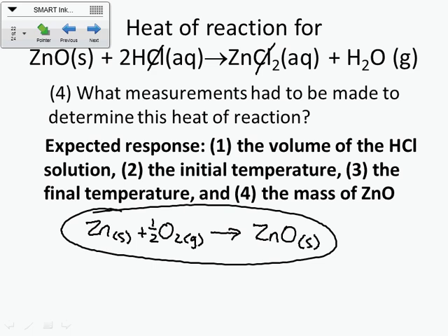Okay. Now again, I think that's really going to help you with the actual lab procedure here. It says, by analogy with the zinc example provided above, develop a procedure that would produce a value for the heat of formation of MgO instead of zinc oxide. Okay? Include steps to ensure personal and environmental safety. Don't mess up the environment with your procedure. Including appropriate laboratory dress and disposal of waste materials. Also construct a data table to record the measurements and observations you plan to make when you perform the lab.